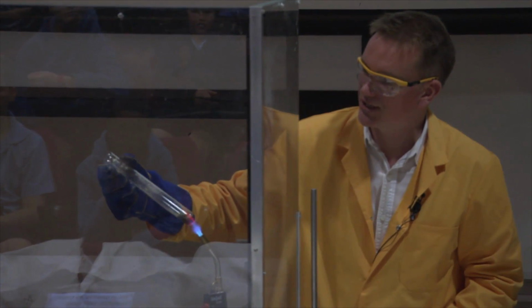And again, maybe if I have the lights down, please. So I'm just warming up the bottom of the tube. Okay, now it's just beginning to glow, and you can see that this glow is spreading through the whole of the mixture. It's all becoming red hot, not because I'm heating it, I've stopped heating it, but because of the reaction taking place as the iron is combining with the sulfur, and it's again giving out a lot of energy as we're making the new iron-sulfur bonds.